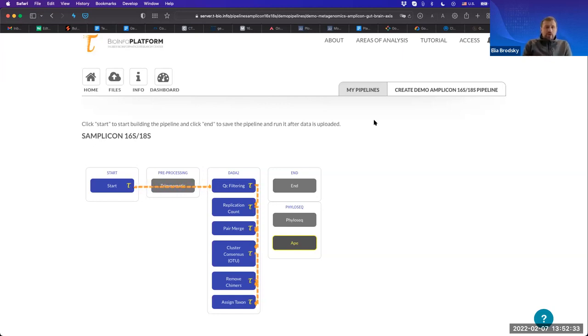Those tables include a table of OTU abundance, or how much of a particular operational taxonomic unit I have proportionately in each sample, and the annotation of where that OTU maps to from the reference database. Because I have the reference database, I also know the relationship between them. How close are they to each other?